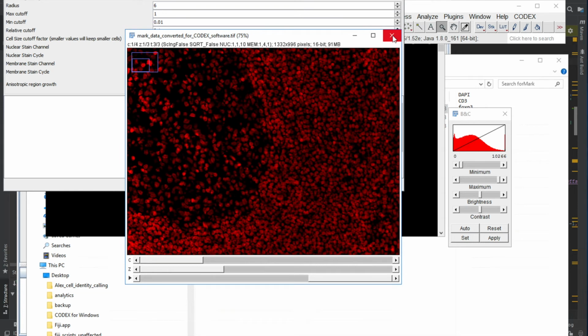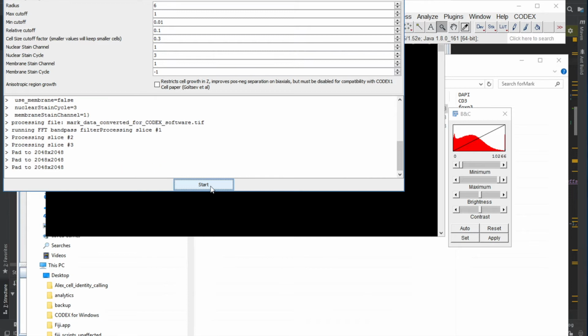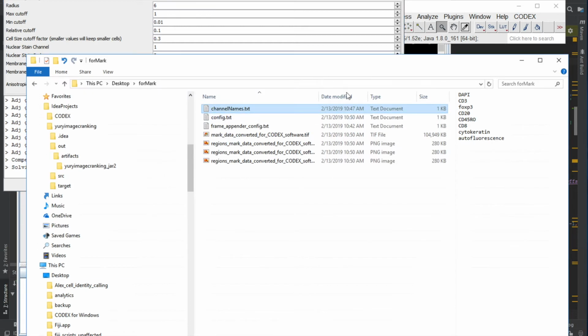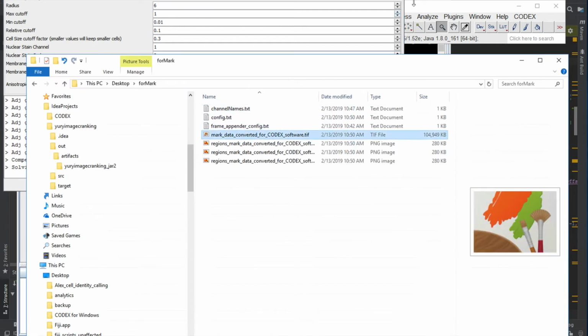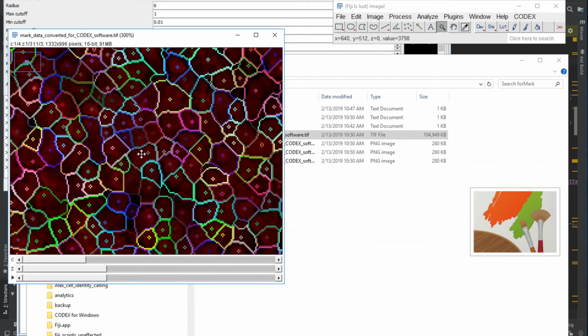I'll close it just in case so that it doesn't open twice in two different programs. Start. It's done. So pretty much done, yeah. So let's see how the segmentation looks. Curious myself. It's not too bad, I must say. Not too bad, right? Look at this.